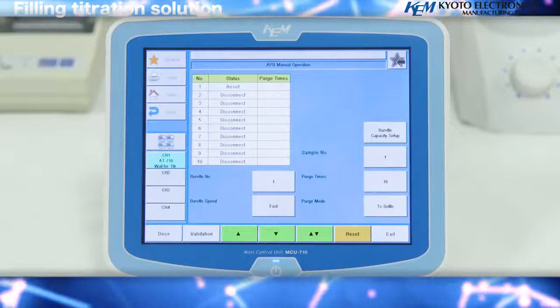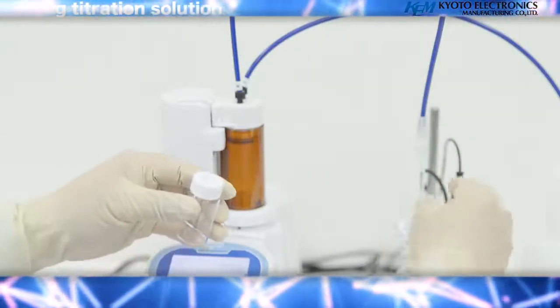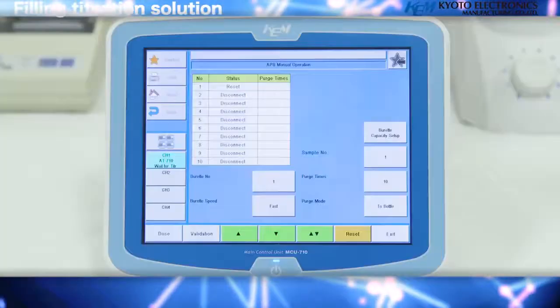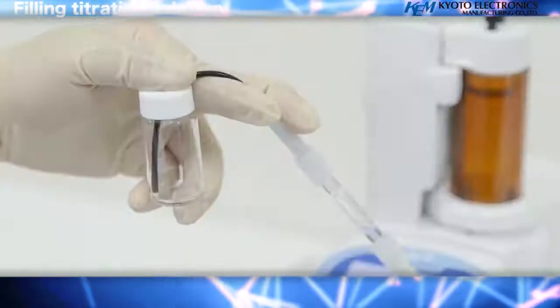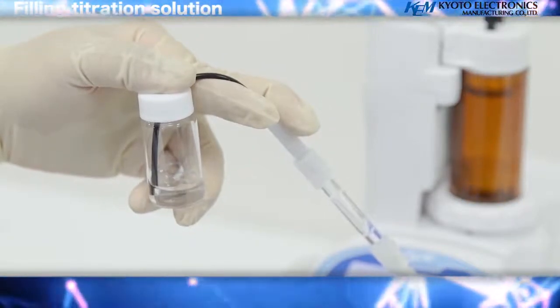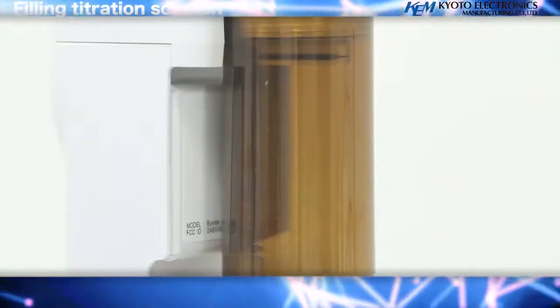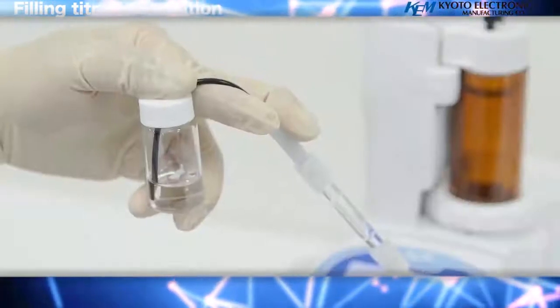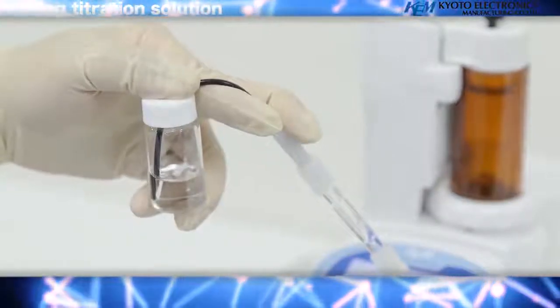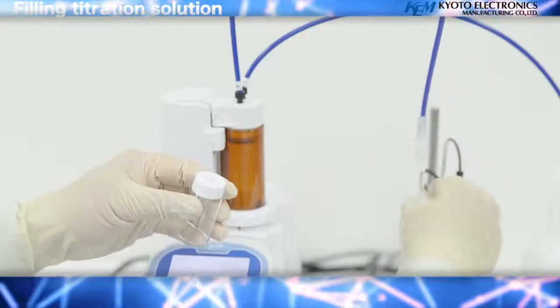When the burette has been filled, press the exit key and return to the top screen. Tilt the degassing vial and titration nozzle slightly upward and press the up arrow key. Move the air inside the burette to the side where the vial is, and when the reagent starts to exit from the tip of the nozzle, push the up arrow key again to stop the piston. Confirm that any air bubbles in the titration nozzle have disappeared, remove the vial for degassing, and attach the titration nozzle to the electrode holder.